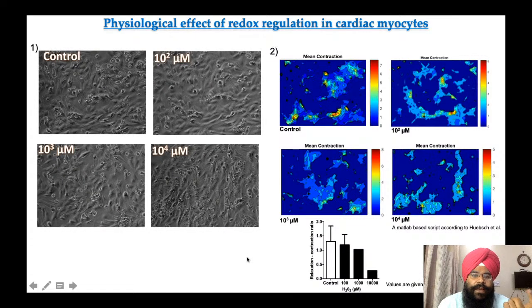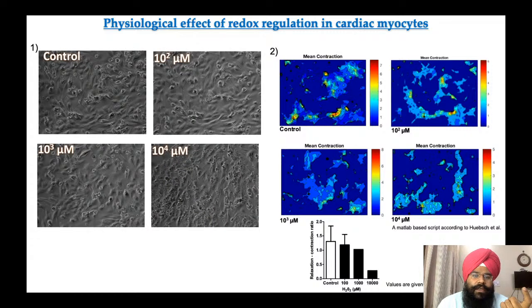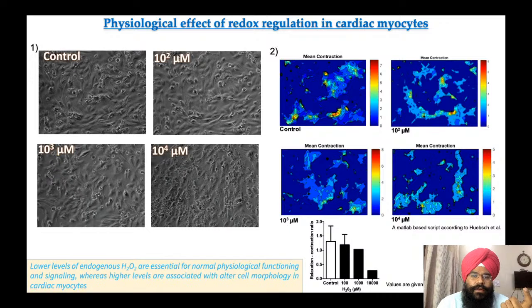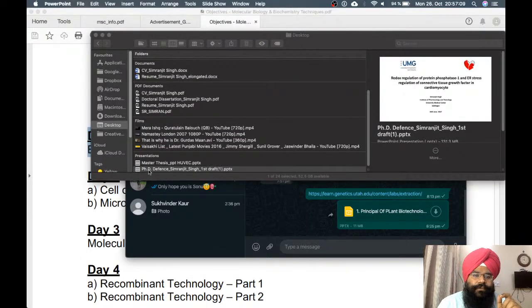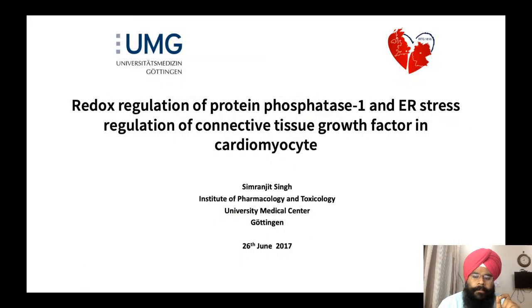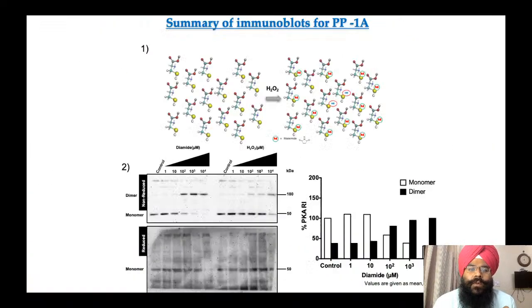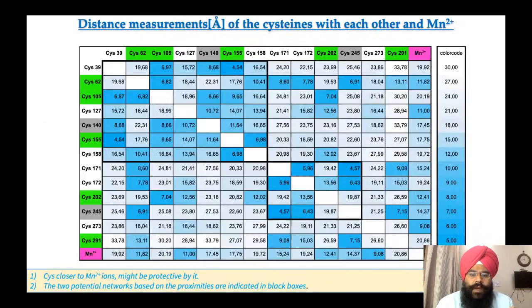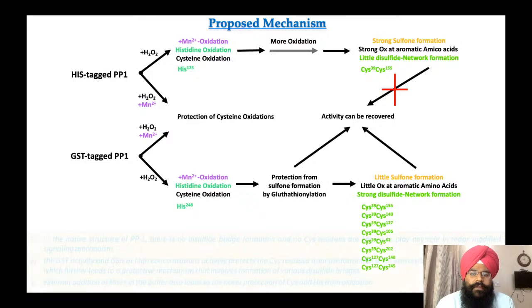So that's the application of the microscope. That's how you can confirm your results, whatever you are looking for, whether they have any meaning or not. And this was done on the inverted microscope, all these details. One more image from the microscopes that I found during my PhD thesis was this, which was my presentation that I gave at the time of my thesis.